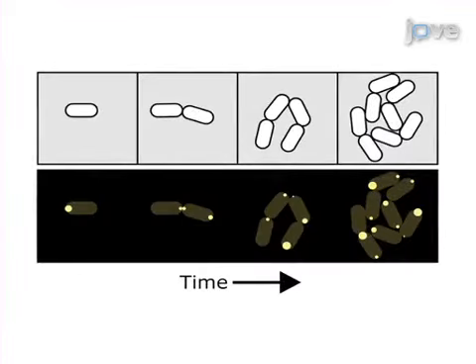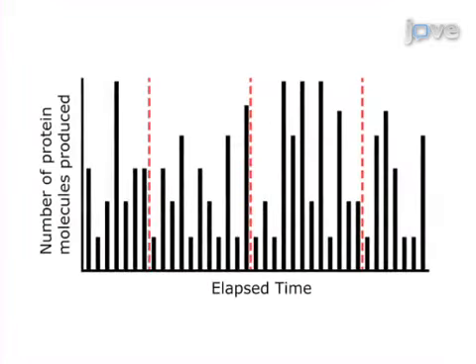The final step is to place the chamber on a fluorescence microscope and image several growing cell colonies at regular intervals over multiple generations, photobleaching newly produced CoTrAC reporter molecules at each interval. Ultimately, CoTrAC is used to acquire time traces of protein production in live cells with single molecule and single cell resolution.